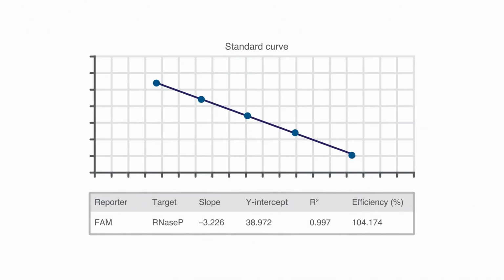Okay, there's one last element to check, and that is the data itself. The alignment of experimental points on the standard curve should be verified. Here's a good curve to use as an example. Use the R-squared value to evaluate the quality of the results. Look for a value of 0.99 or higher. This is a good indicator of your pipetting skills for your technical replicates.